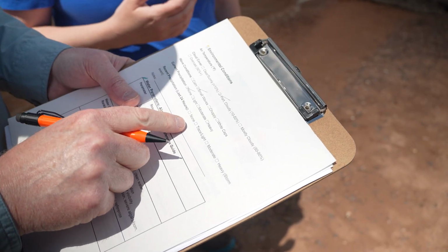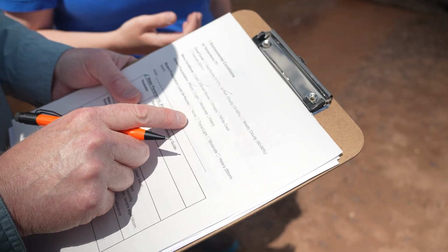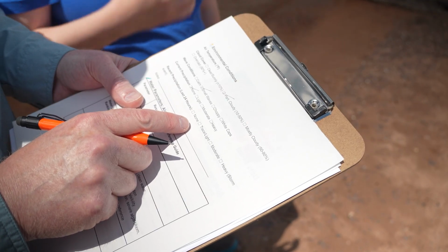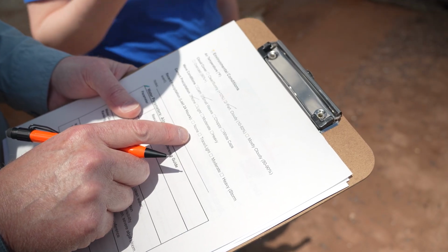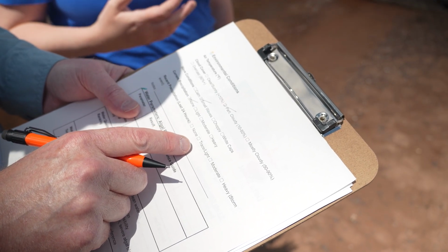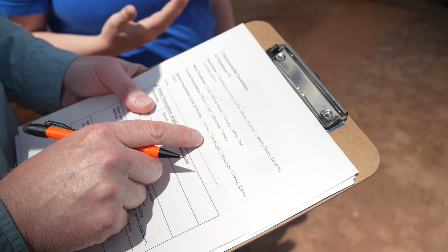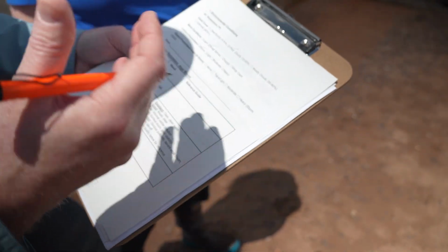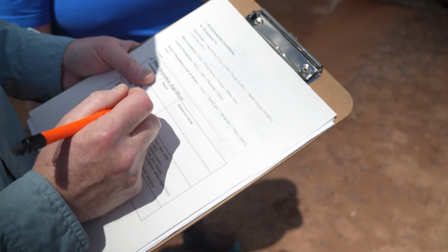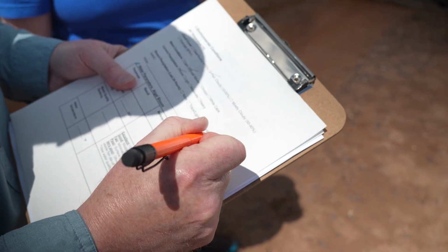We also want to know about recent precipitation. So has there been rainfall in the last 24 hours? Especially we want to know if there's been a heavy rainfall event recently, because this is something that can wash nutrients like phosphorus and nitrogen into a body of water, and these nutrients can contribute to the formation of a harmful algal bloom. And it just so happens yesterday we had a very nice storm system move through Duluth. So here I would probably write heavy storm event, at least where I live, it was pretty heavy. It was heavy, yeah, so I would note that.